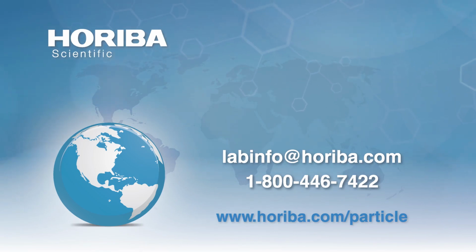Our recommendation and a best practice that we would make would be to apply that optional top coat or seal coat over your functional coating layer. So applying a clear, perhaps HPMC based top coat. It can be clear, it can be pigmented in certain situations if you choose, and applying that over the functional coating layer.